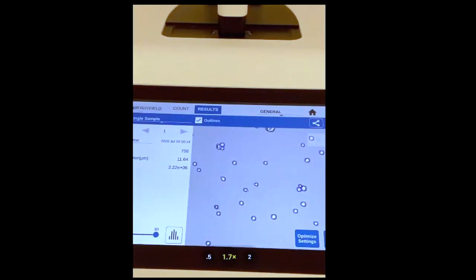So as I was saying, you want to check your cells, make sure that they're counting properly. Don't just trust the device. That's a real advantage that the Cell Drop has over some other cell counters, that you get a real nice, clear, high quality microscope image where you can see debris or contamination in that sample. And you can also verify that things are getting counted correctly.